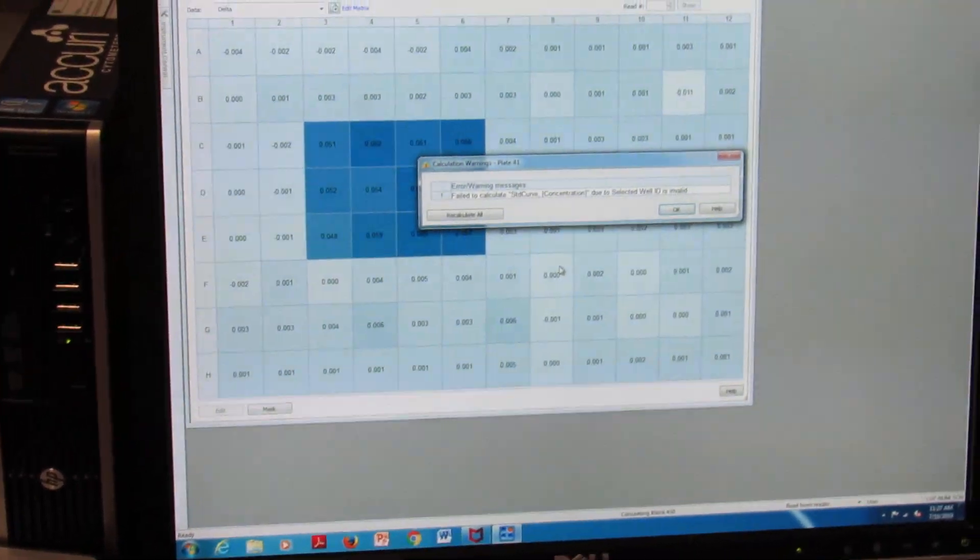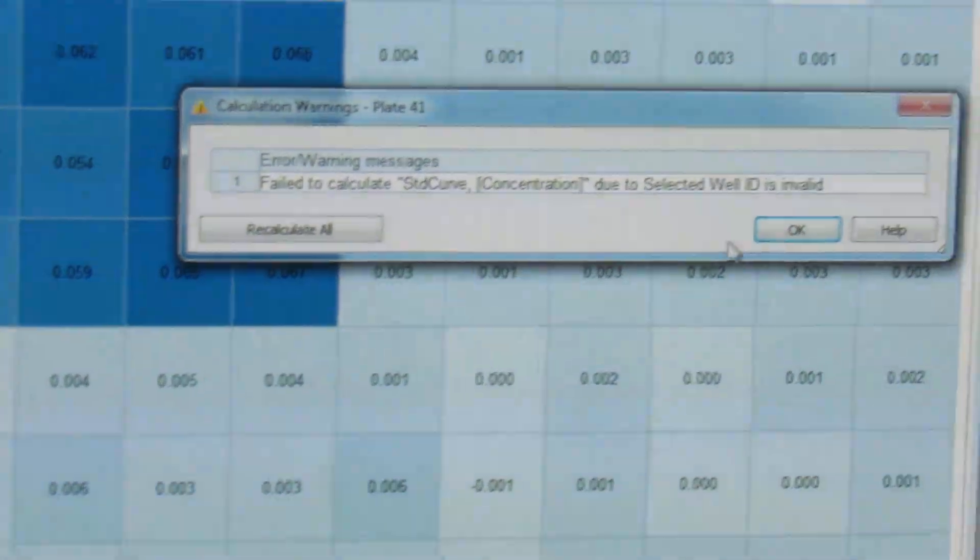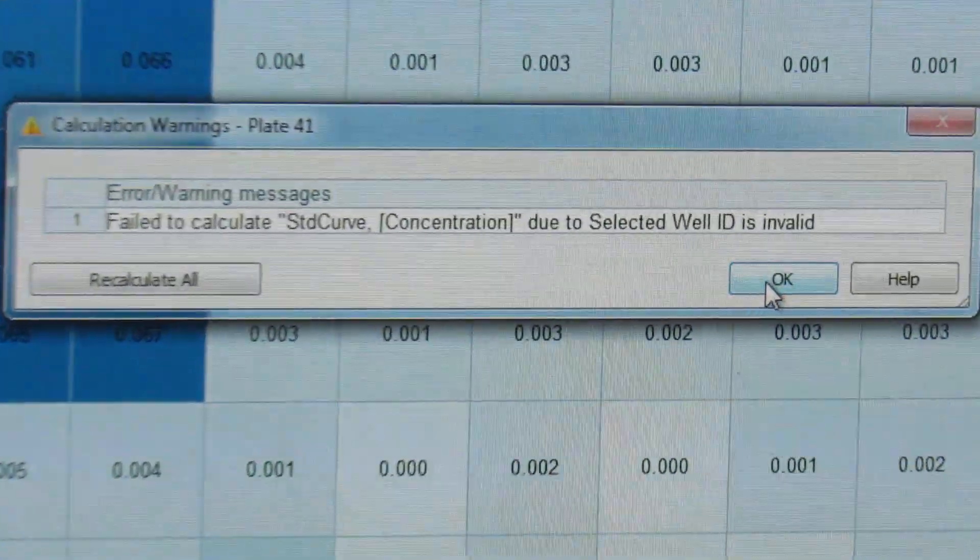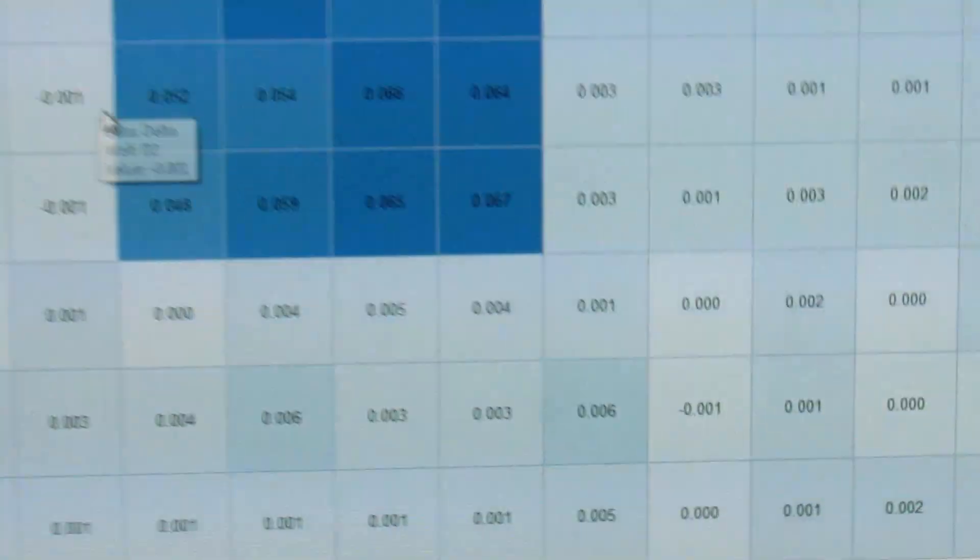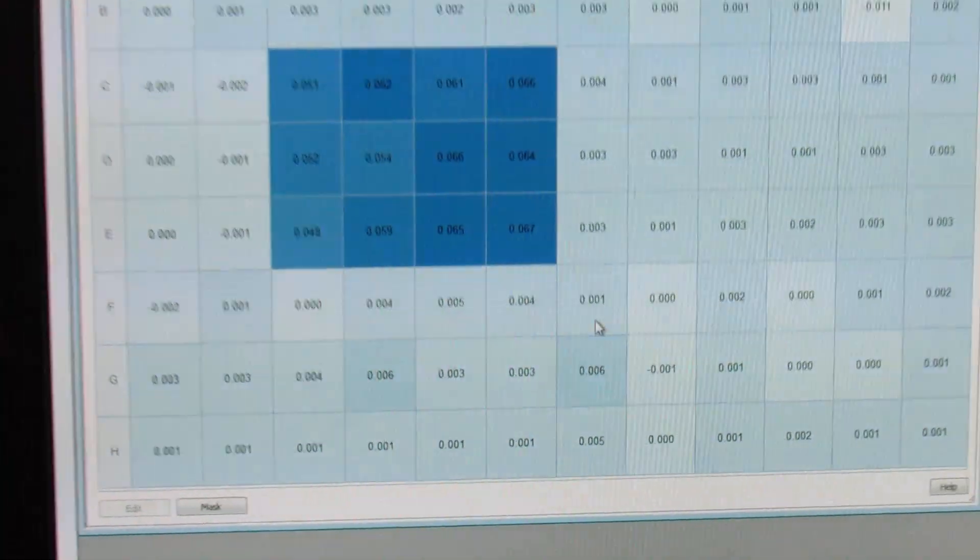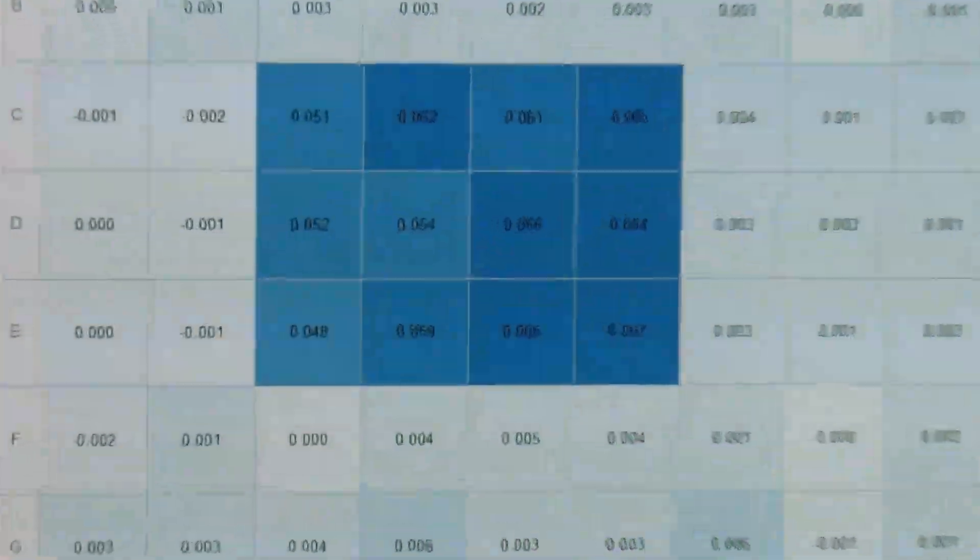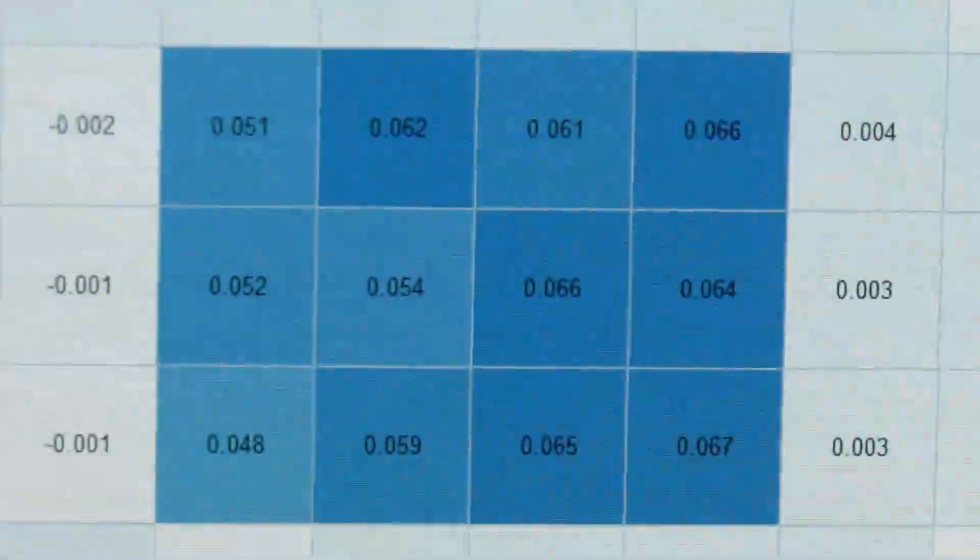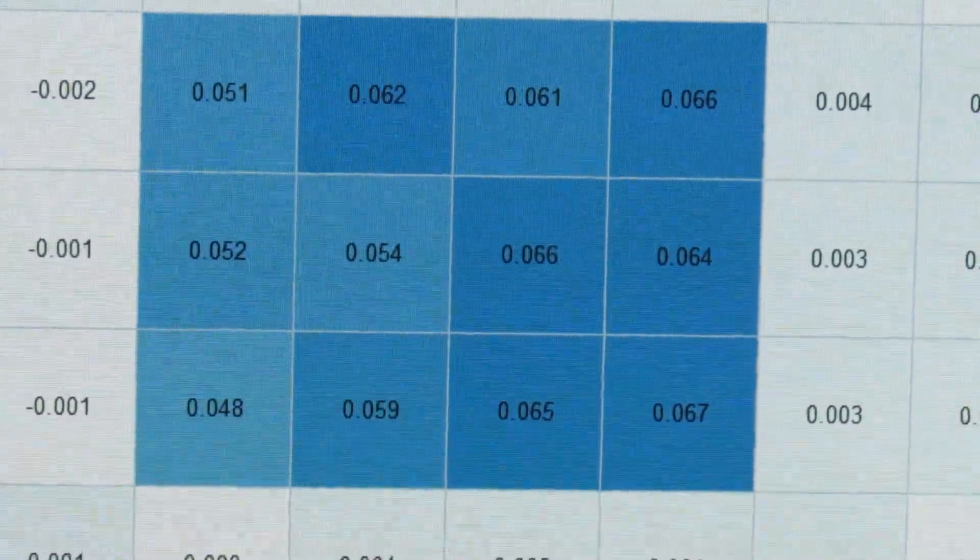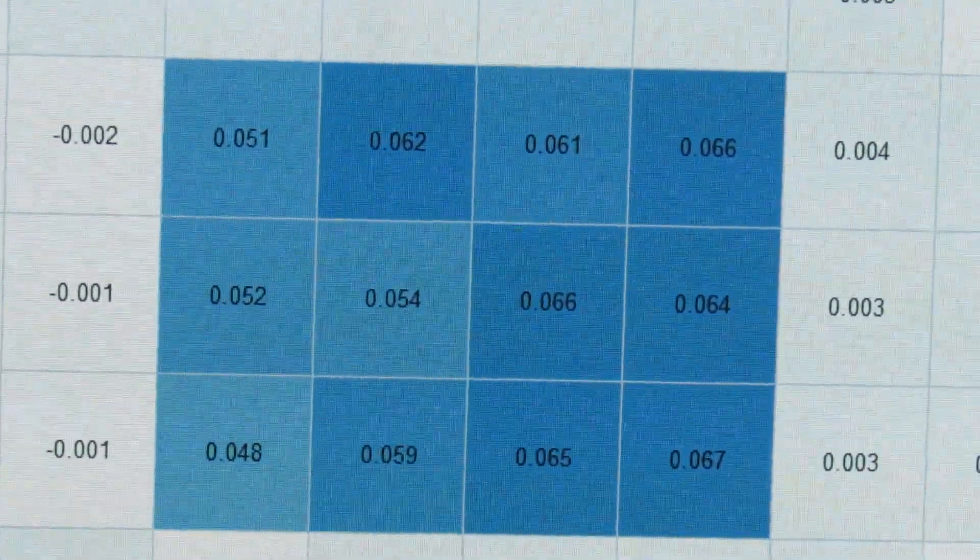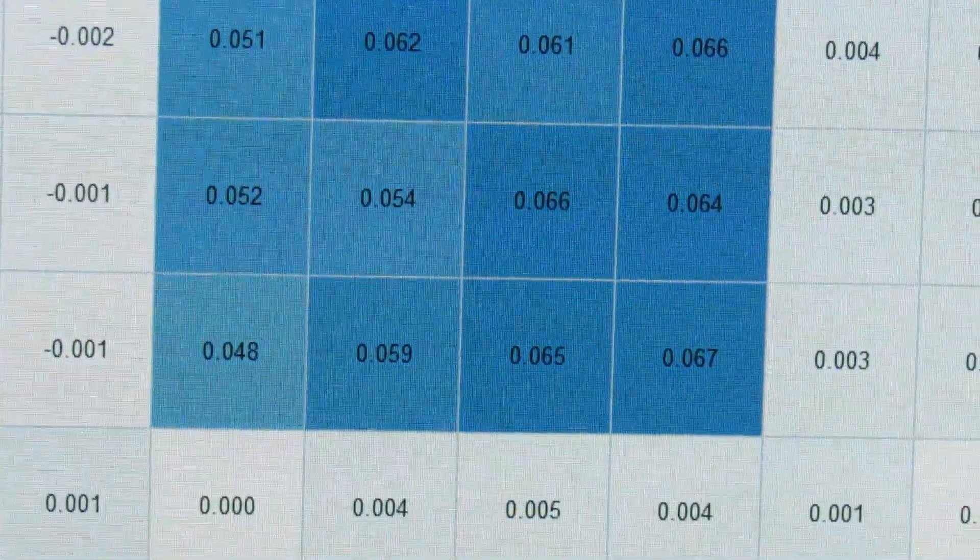After your plate reader is done, you will get this warning message. You are OK just to hit OK to that. And this is what your plate reader should look like whenever you are done. As you see, your samples are going to be a very dark blue and all of your blanks are just going to be that light blue background.